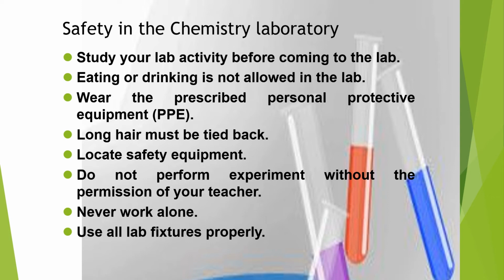Safety in the chemistry lab. You study your laboratory activity before coming to the lab. Eating or drinking is not allowed in the laboratory. You don't want your food to be contaminated, or if you're culturing media, of course, you want your environment to be sterile.